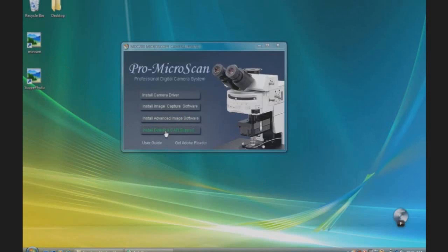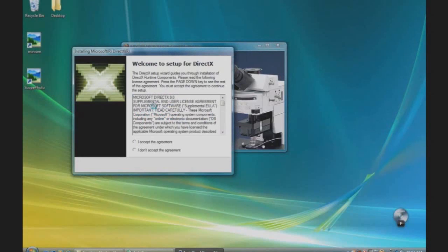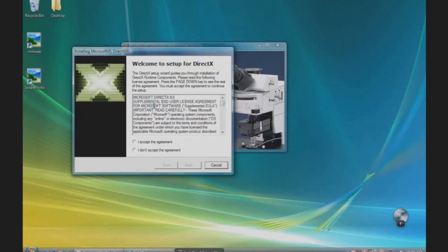Read the Terms of Agreement and click I accept the agreement. Then continue.